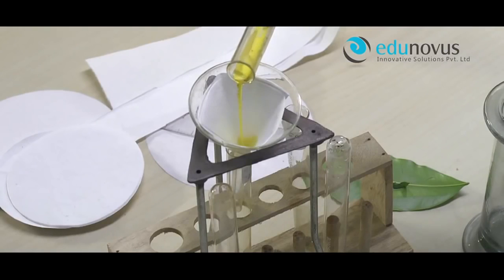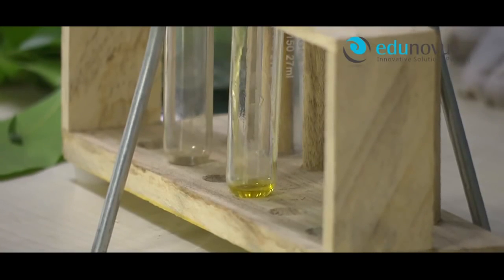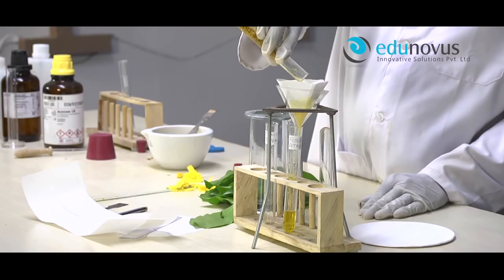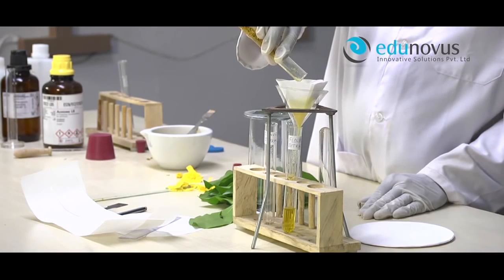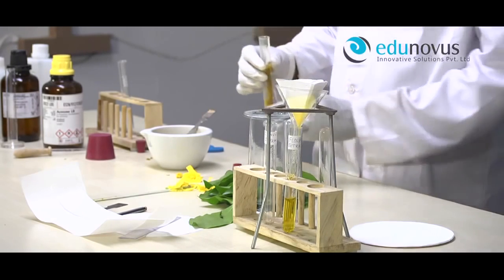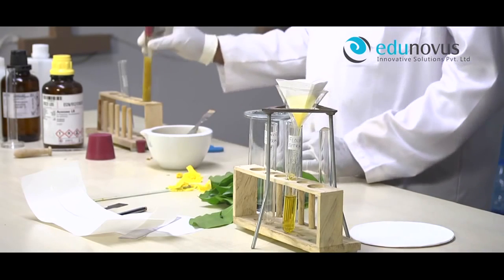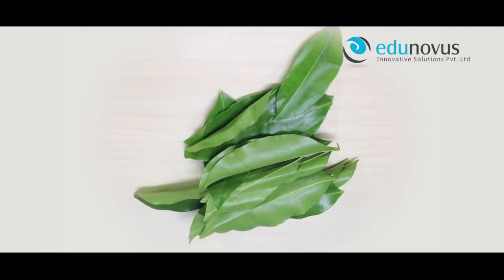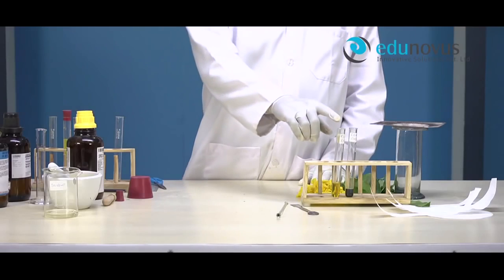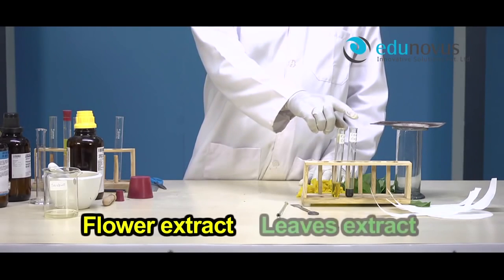Filter the contents of the test tube to obtain flower extract juice. In a similar way, extract juice from leaves as well. Here we have flower extract and leaves extract.